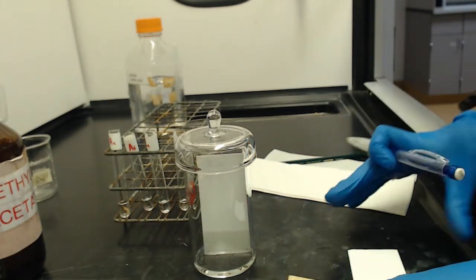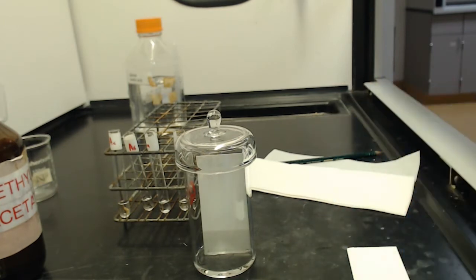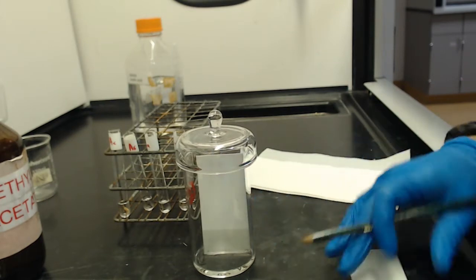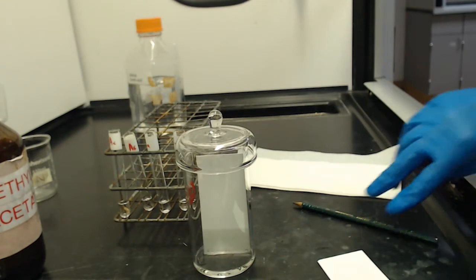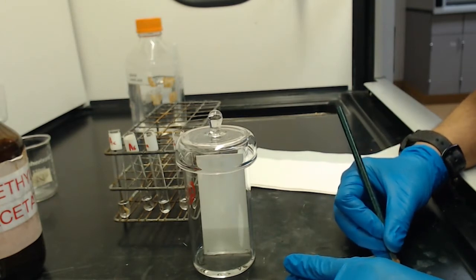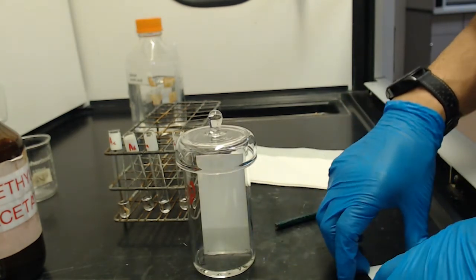Okay, just like before, I'm going to draw a line across using the correct kind of pencil. That's not the correct pencil, this one is. Oops, that is okay. Okay, this last one's going to be salicylamide, I believe. Oh, SA. And then I'm going to put UN for unknown.